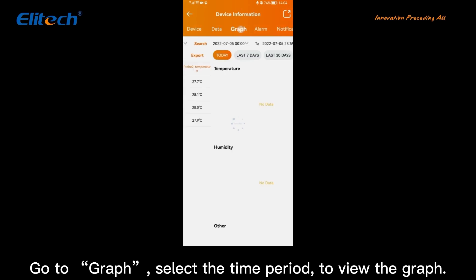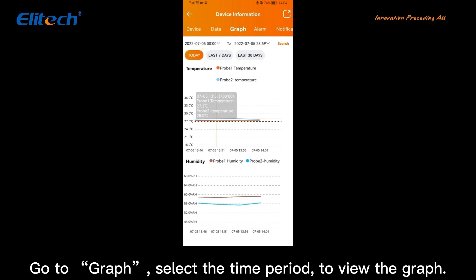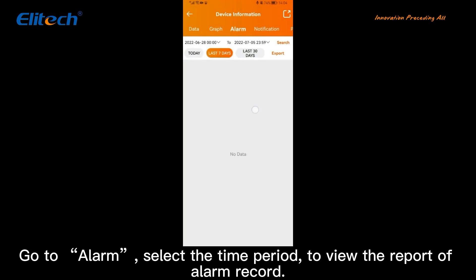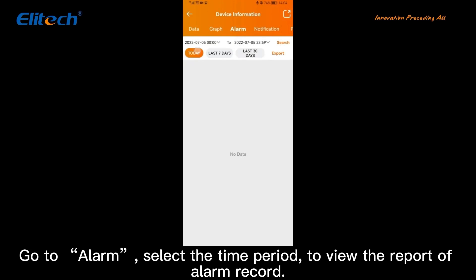Go to Graph and select the time period to view the graph. Go to Alarm and select the time period to view the report of the alarm record.